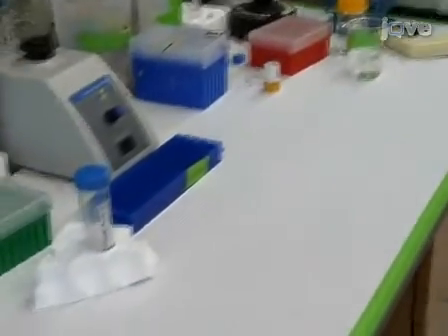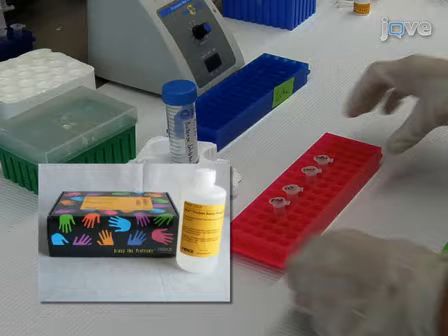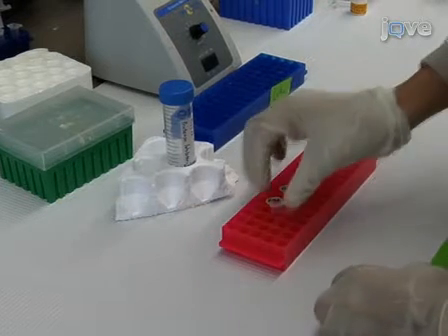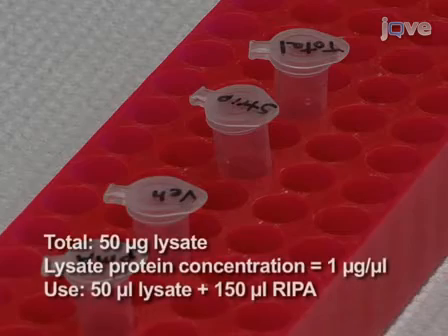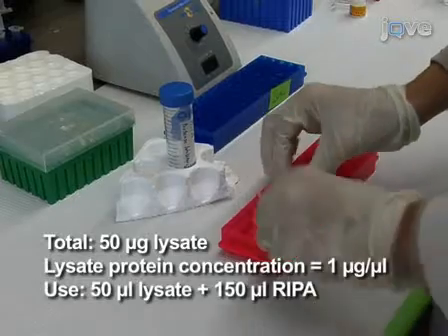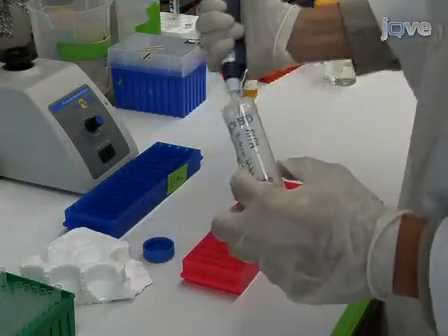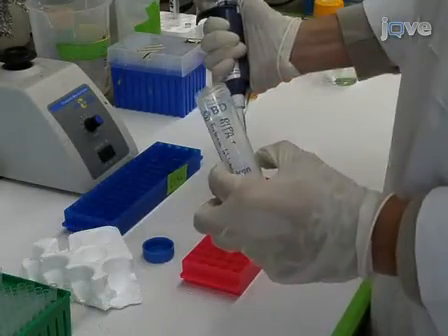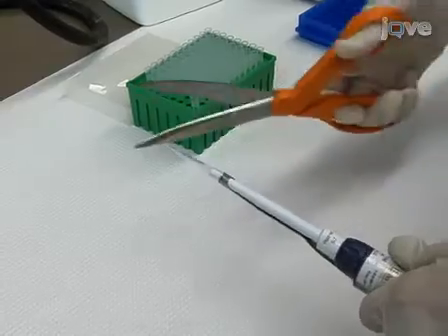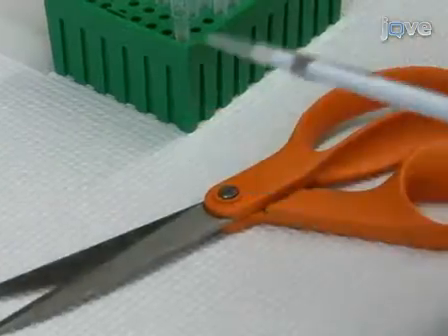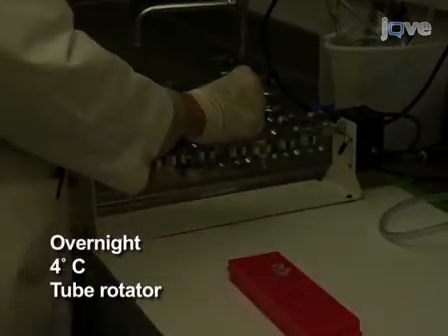Use a protein assay compatible with your lysis condition, for example the BCA protein assay from Pierce, to determine lysate protein concentration compared to a standard bovine serum albumin curve. Following this, prepare lysates for streptavidin affinity chromatography by filling 1.5 milliliter microfuge tubes with equivalent amounts of protein from each sample. In this experiment, we isolate biotinylated proteins from 50 microgram cell lysates. Add RIPA buffer containing protease inhibitors to a final volume of 200 microliters for each sample. Vortex streptavidin agarose beads vigorously, then using a 200 microliter pipette tip with the end cut off, pipet 20 microliters of streptavidin beads into each tube. Vortex the tubes and incubate overnight at 4 degrees Celsius on a tube rotator.